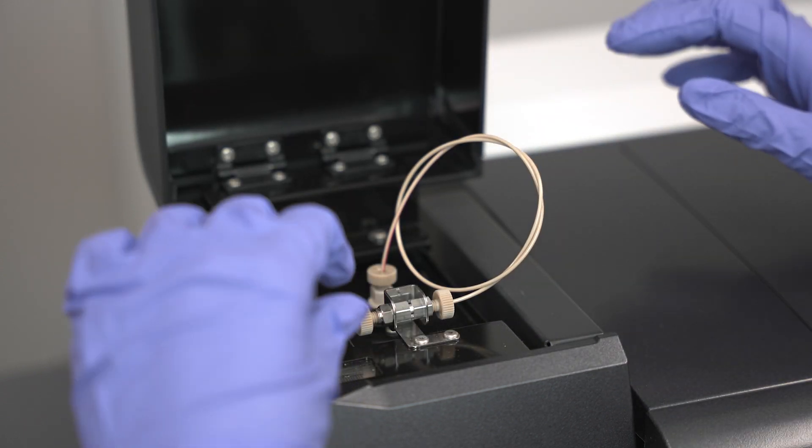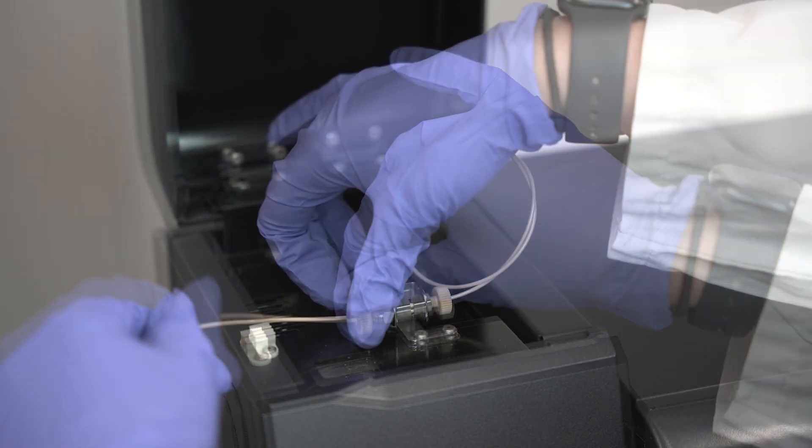First, open the ESI probe cover and remove the peak tubing from the source inlet.